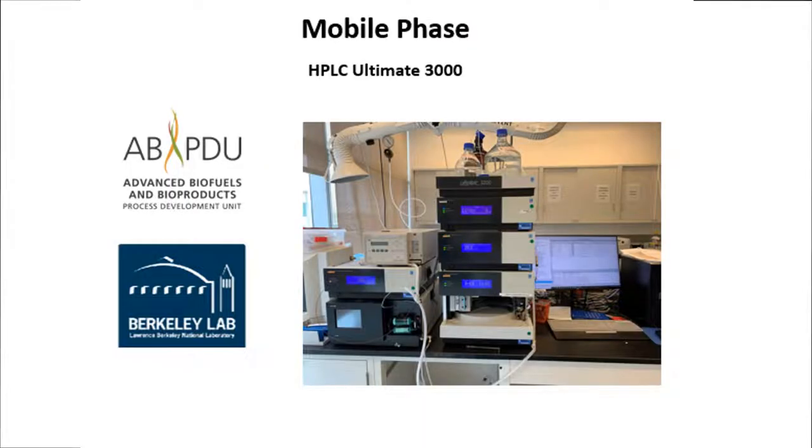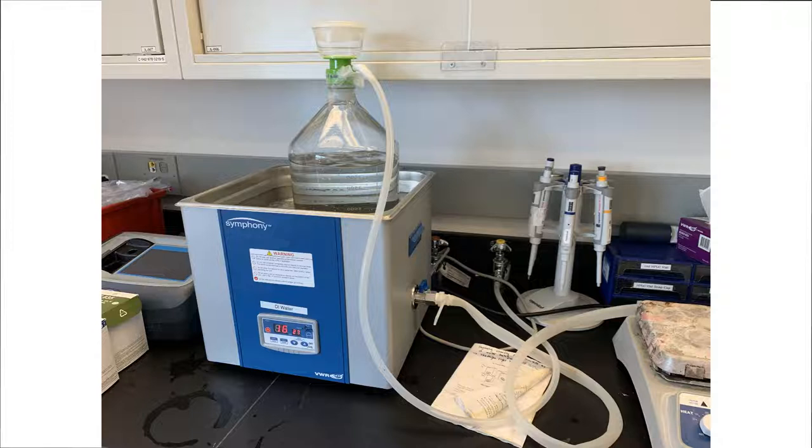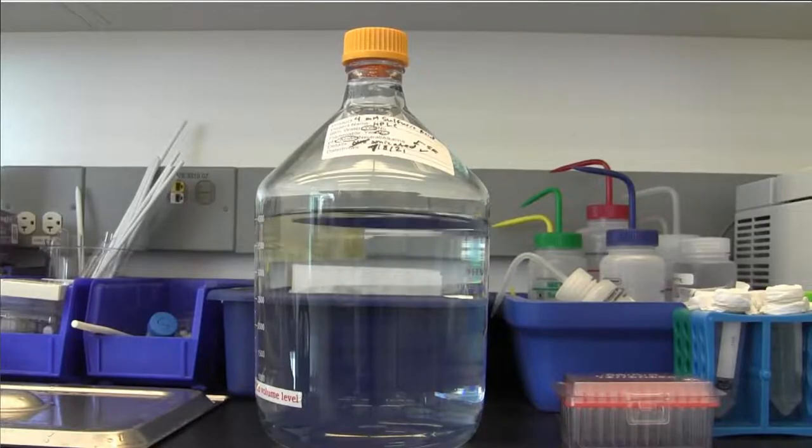Eluent preparation should be done using deionized water and analytical grade reagents in cleaned analytical glassware. In most cases, prepared eluents should be degassed using a sonicator. Here we will show how we do the degassing.